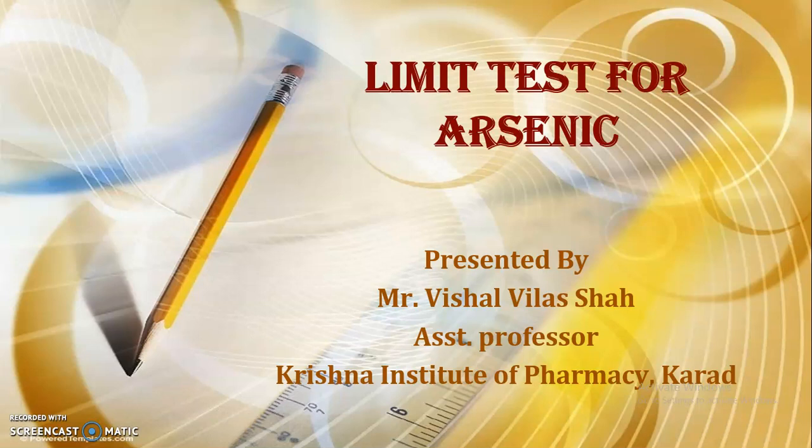In this video, we are going to cover the limit test for arsenic. In the previous video, we covered the limit test for iron.